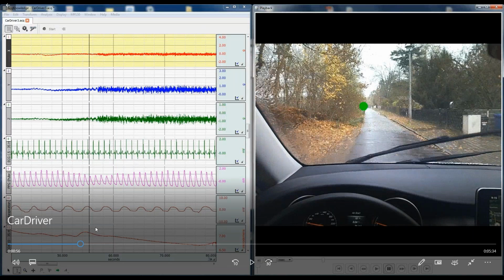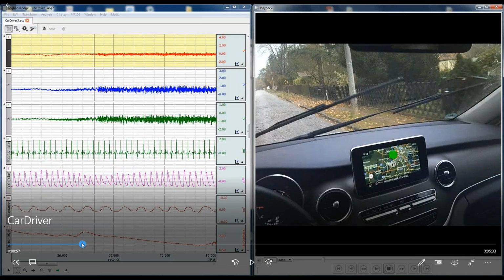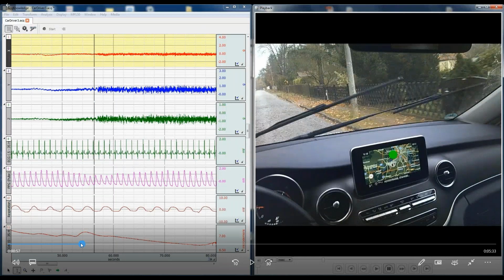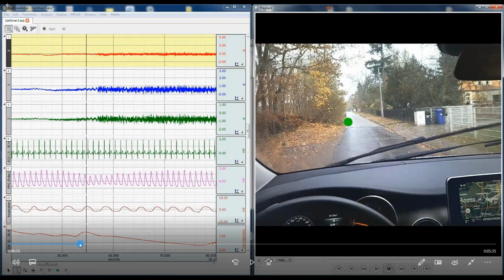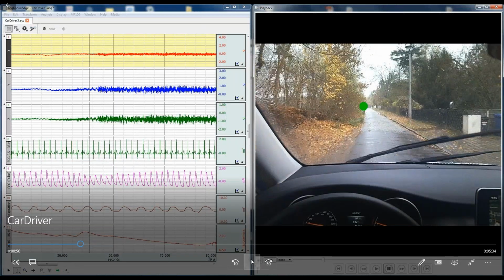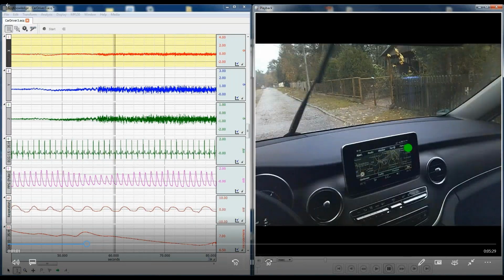That is the point where the car transitions from the smoother asphalt to the cobblestones. And just about here, right about here, we can see the car is now on there. So if I just play this video, now the car's driving over this rough surface, and we're able to pick that up.